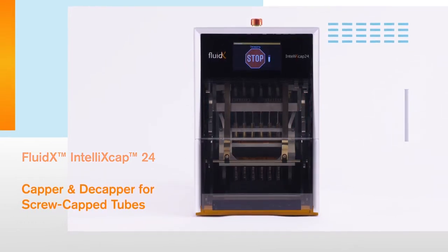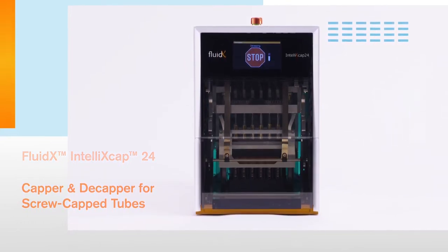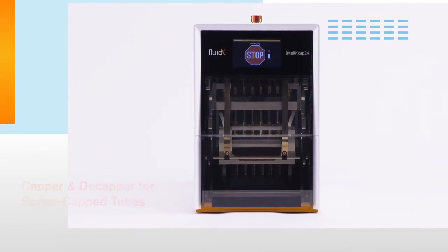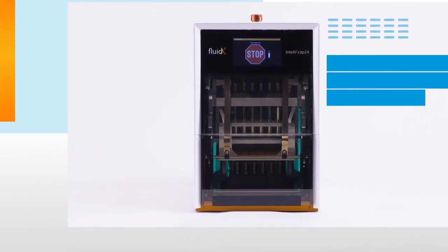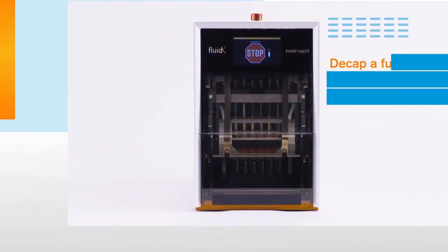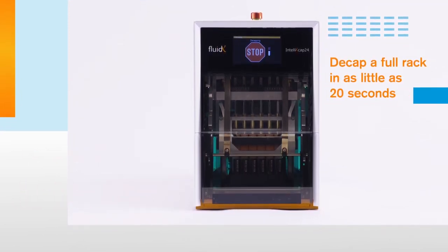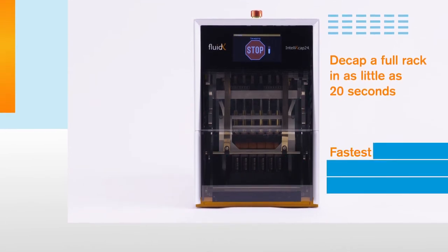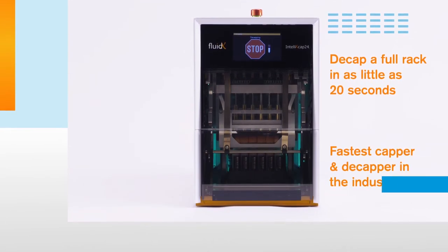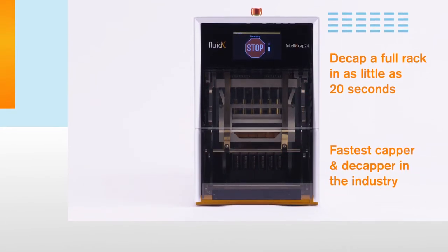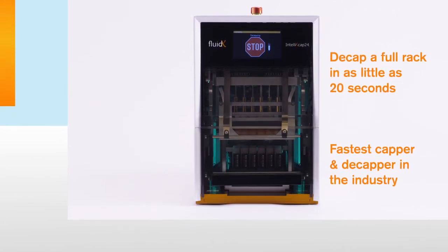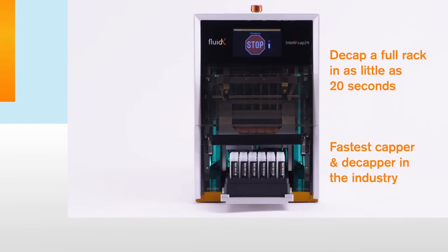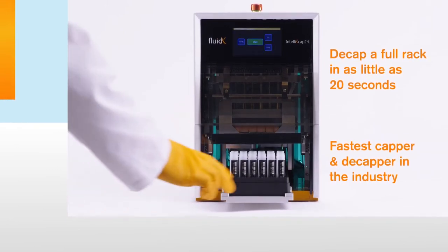The first thing you'll notice about the Intelli XCAP24 is its speed. Able to decap a full rack in as little as 20 seconds, it's the fastest capper and decapper in the industry that's compatible with storage tubes from a variety of manufacturers.